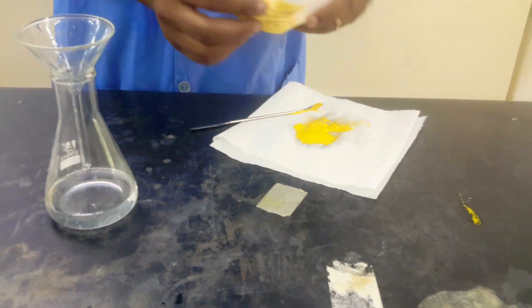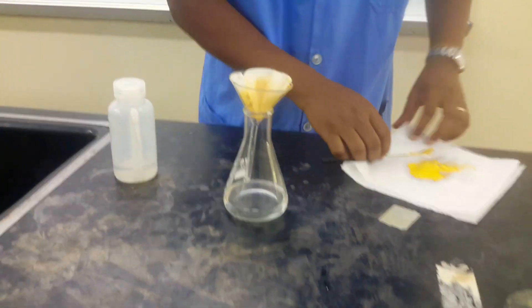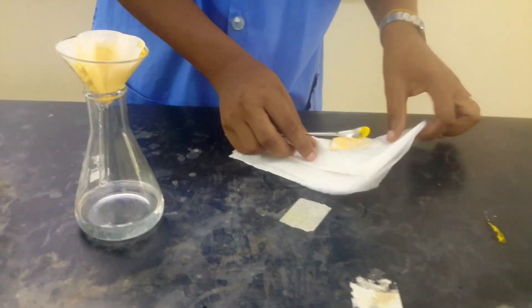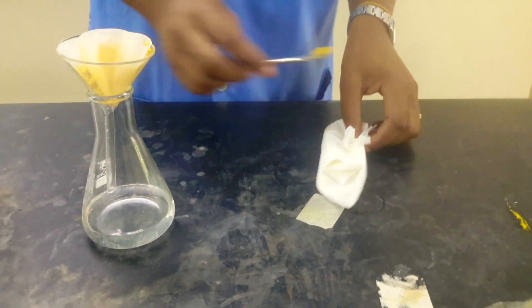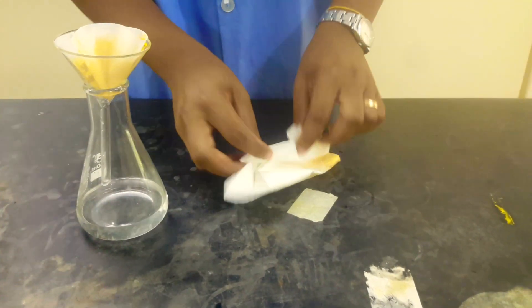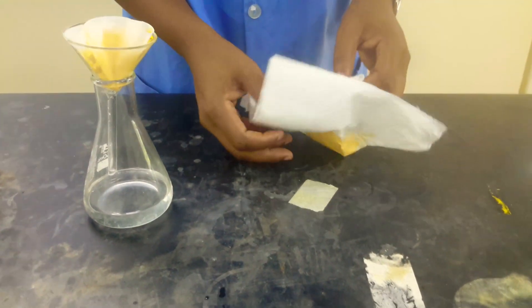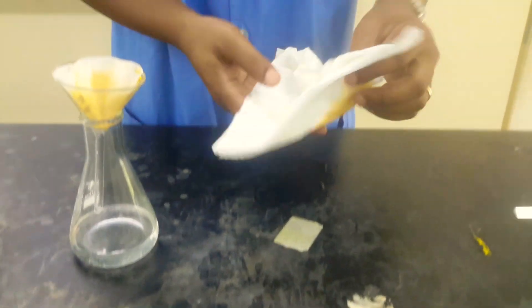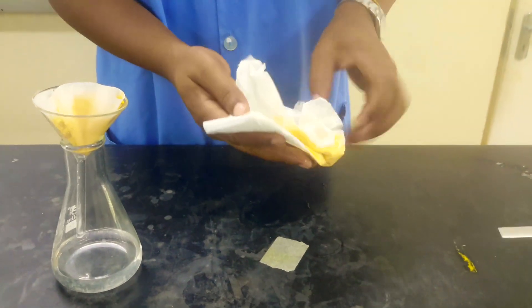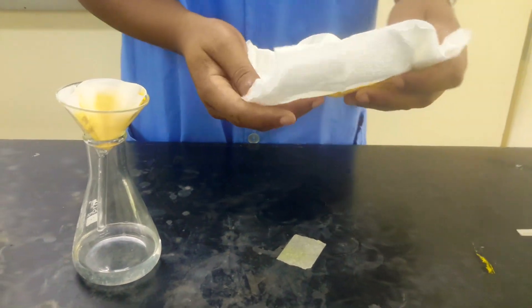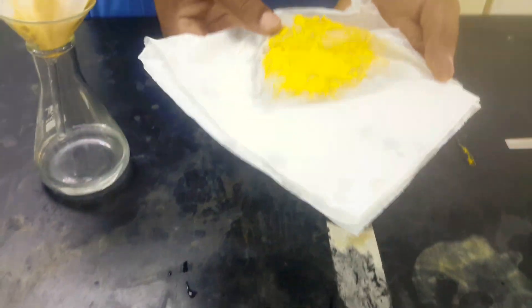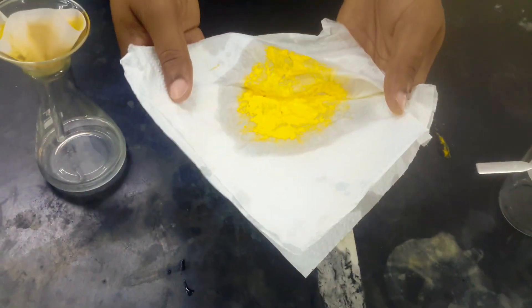So we'll just pat it dry between paper towel and it will be good to go. So let me do a little bit more but this is our final product. It's a little powdery, bright yellow lead iodide. So there we go.